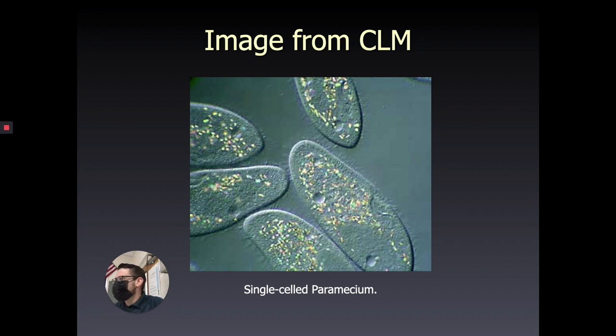A typical CLM gives you a magnification factor somewhere between 40 to potentially 5,000 times magnification. That is, whatever you're looking at underneath the microscope, it will be 5,000 times larger than normal. And that's a pretty top-of-the-line type of CLM. The ones that we have in class go up to 1,000 times magnification, but the 1,000-times magnification objective is what is called an oil immersion lens and takes a special technique to work properly, so we don't typically worry about that one.